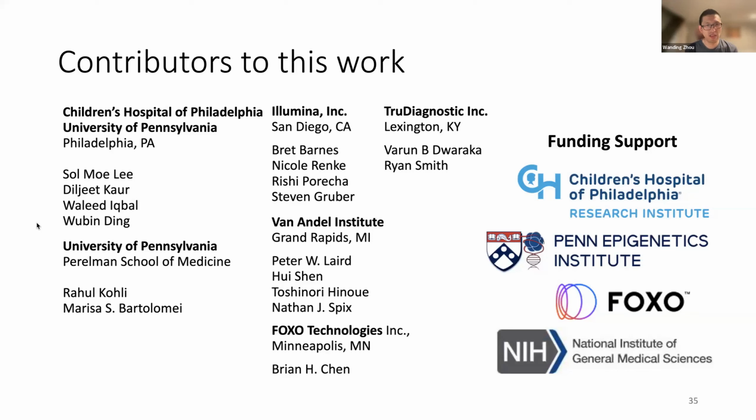In terms of method development, I think there are a lot of exciting developments in data science that are leveraging the vast abundance of array data out there. But it's the same challenge that I was mentioning, which is how do we develop these platform-independent, robust methods, right?